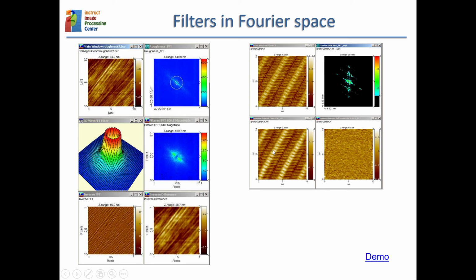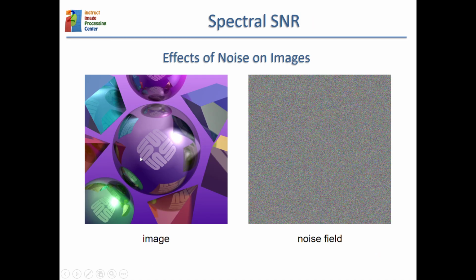So what you have here is a much cleaner version of the original image, because the energy depends on many things, but the energy of noise tends to be more or less equally distributed, while the energy of your signal tends to be concentrated at a few, normally low frequency, components. So by identifying those components that are more likely to come from the signal than from the noise, you're removing a lot of noise.